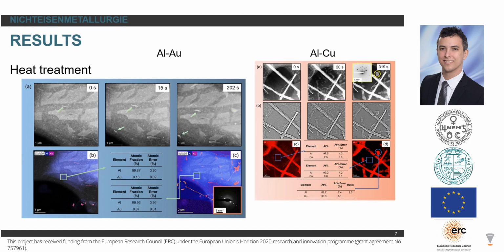we cannot actually say much regarding the EDS because we have a really low signal, a low amount of gold in solution. But we were lucky enough to have a particle at the hole region. And we could do a selected area electron diffraction pattern there, and we see aluminum gold reflexes, which are possible phases to be built on this left side of the phase diagram of aluminum gold, which is a good sign showing that the alloying was actually possible in this case.